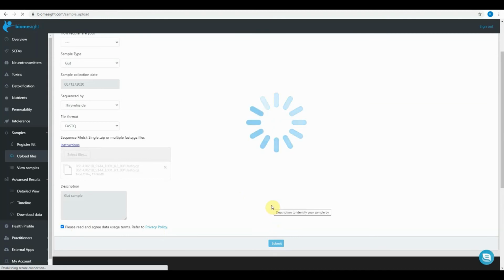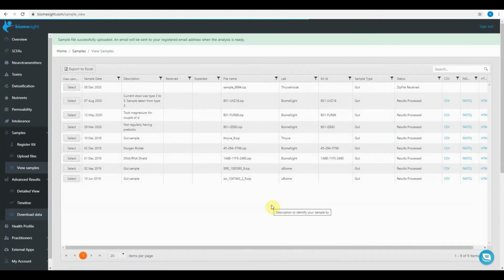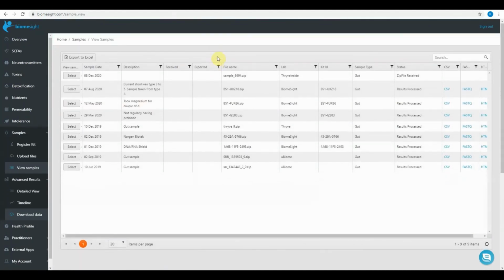So that's it. There will be some additional validation that's completed as part of the upload. If there's any problems, you will get a notification straight away at the top that there was a problem, in which case you'll be able to amend the form. Now the process is that we send the files off to get analyzed, and as soon as that's ready, we upload the data back into Biomesight, and you will receive an email as soon as the data is available. That process normally takes around 10 minutes if there's no backlog. Occasionally it can take up to 12 hours.